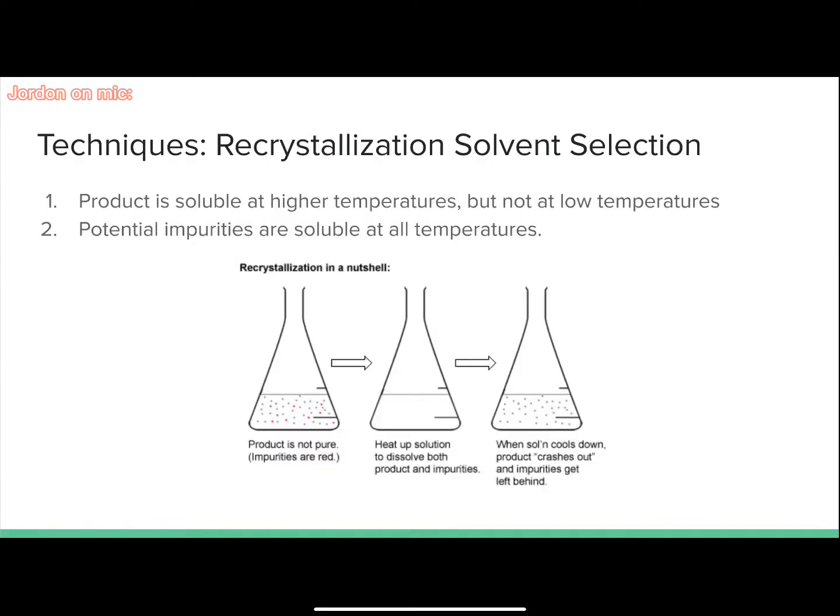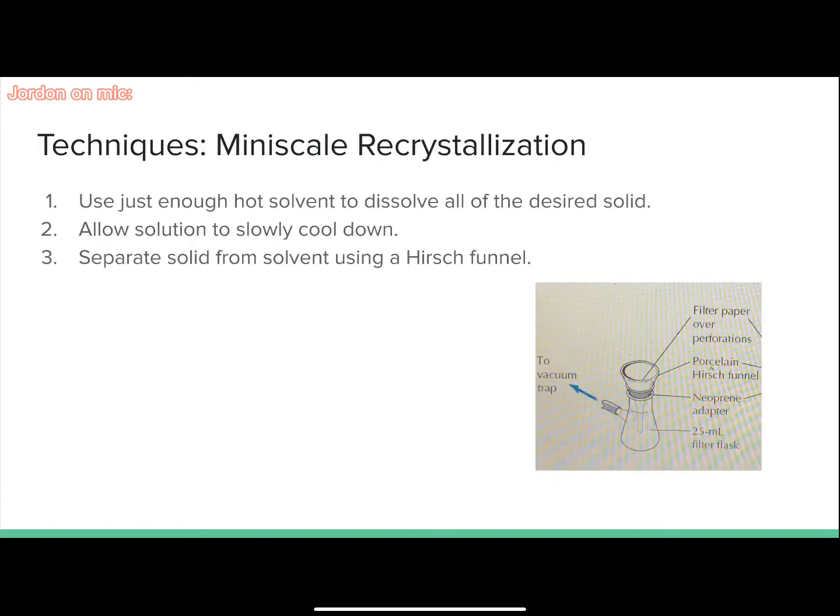In techniques, recrystallization, solvent selection. There are two major points. First, the product is soluble at higher temperatures, but not at lower temperatures. And second, the potential impurities are soluble in the solvent at all temperatures.